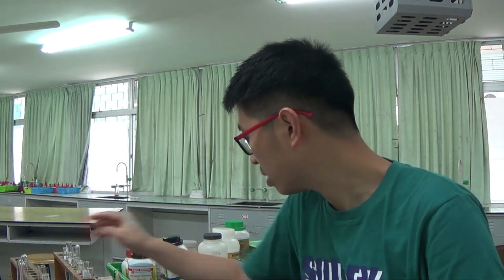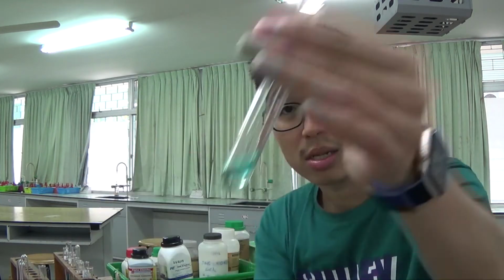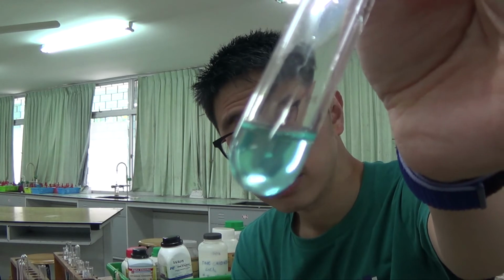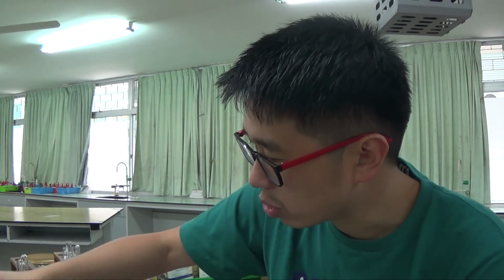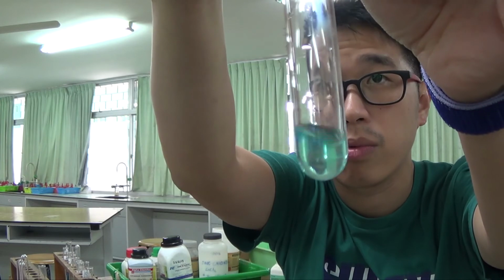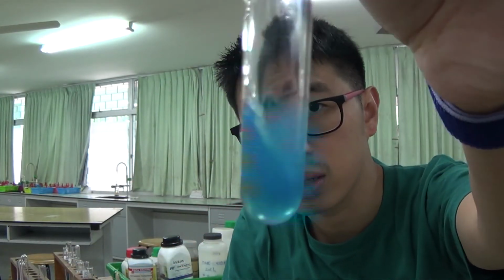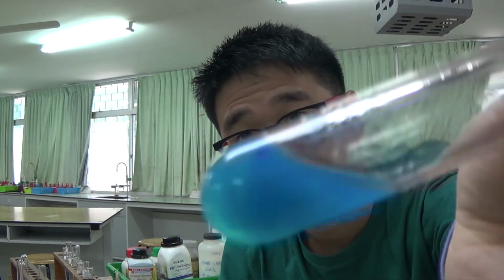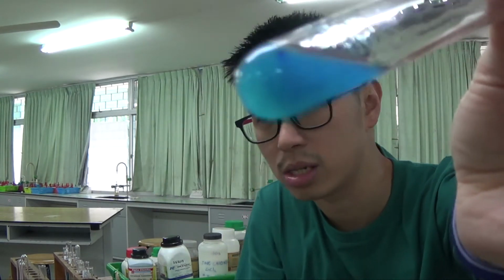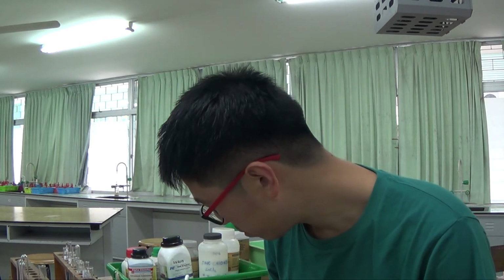And I'll have to test the other portion. Here is the pale blue solution, and then I'll add some sodium hydroxide, NaOH. Make sure you know the formula. You can see that this is a precipitate. It's not a solution at all. You also get a pale blue precipitate.